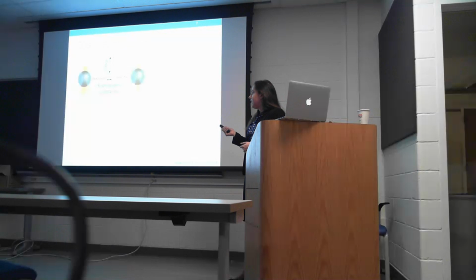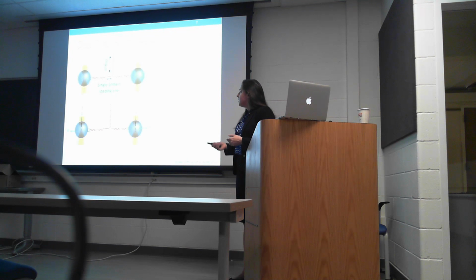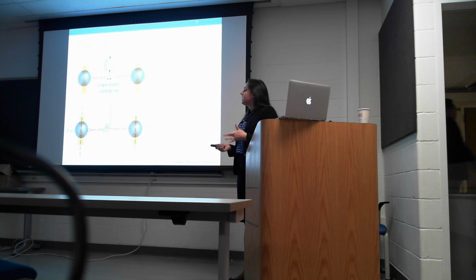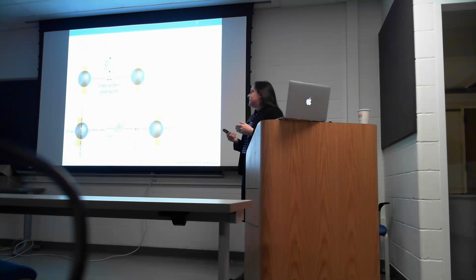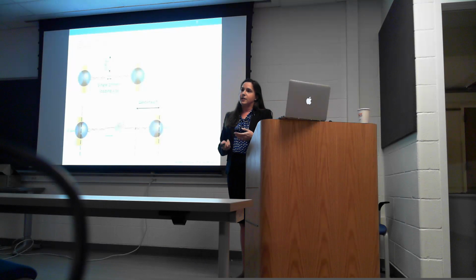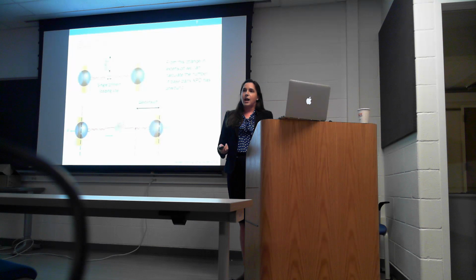Pairs of double-stranded hairpin available for XPD to unwind. So in these experiments, we hold the DNA at tension and incubate in XPD until a molecule of XPD binds. Then, upon exposure to ATP, XPD begins unwinding the hairpin, and since we're at constant force, the total extension and the distance between our two traps changes.